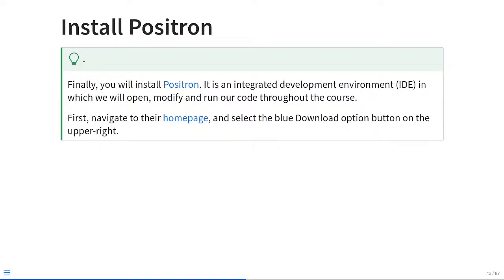The reason we're using Positron for this course is a lot of the things that you had to really search for to find in RStudio are a lot easier to get to. So you can hover over things to get to the help files. All the folder projects that you have are visible from the get-go. You don't have to go searching for different customizations, and setting up GitHub is a lot easier than it is with RStudio, especially with Macs, so it's the main reason for using it.